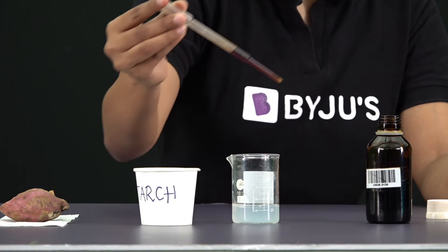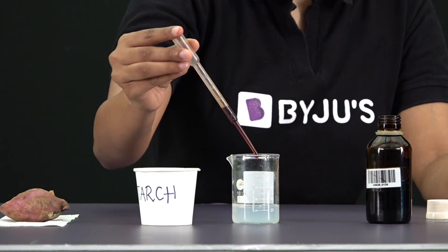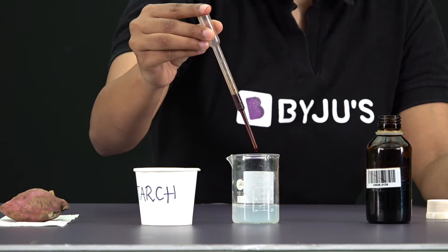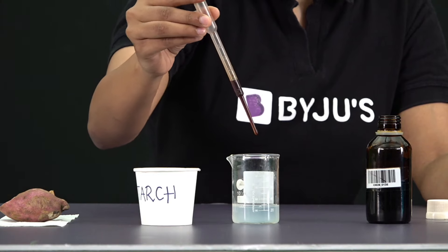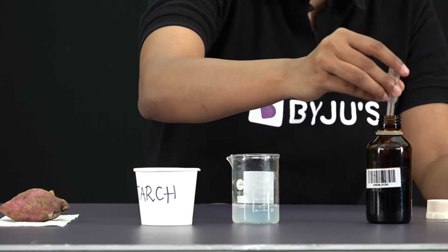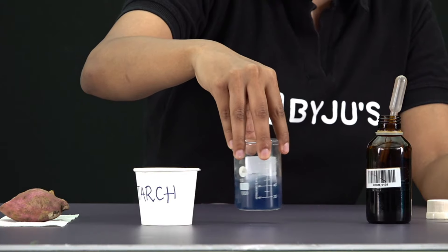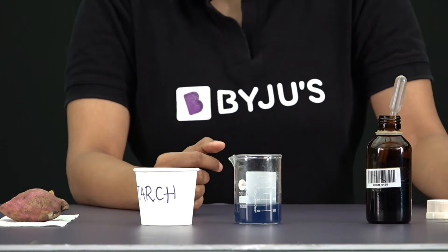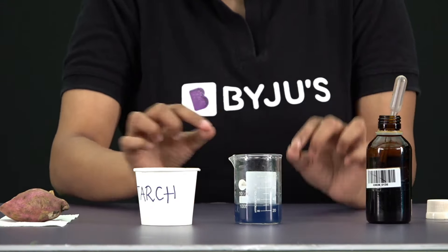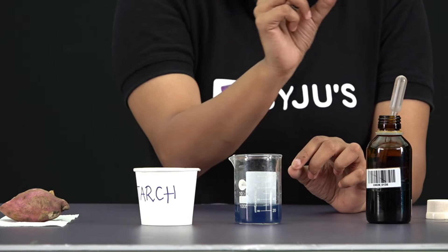Now what we are going to do is add a drop of iodine to the starch solution. Our brownish color iodine — I'm just adding one drop — and I'm going to mix it. Voila! What do you observe? We see here that the whitish color and the brownish iodine have now come together and given us a blue-black color, which means that if starch is present, this is the color change we would observe.